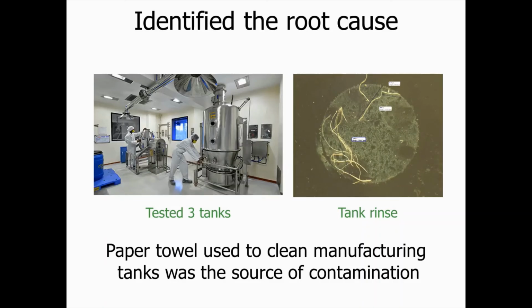With this information, they could figure out the pathway how particles got into the product. The tanks were cleaned with lab wipes that released fibers, and those fibers finally ended up in the product. Knowing this pathway, the particle source could be easily removed.